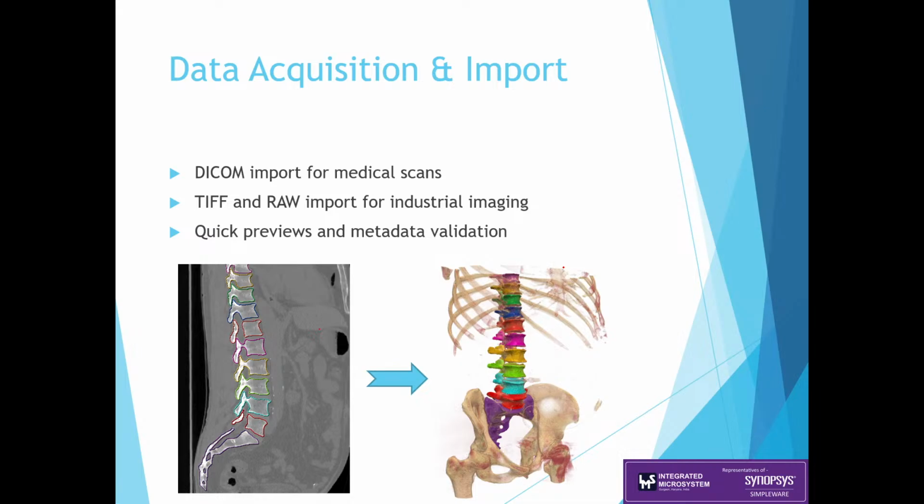Whenever we are doing the segmentation, the first and foremost important part is to import the DICOM images, or any TIFF or raw image data set that we are working with. Then we can use various sets of operations to do the segmentation.